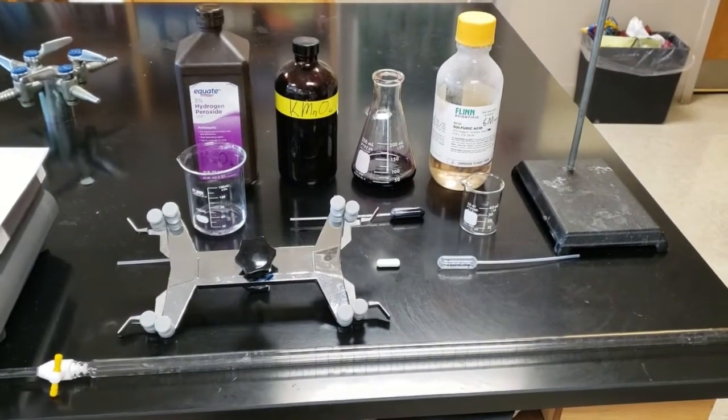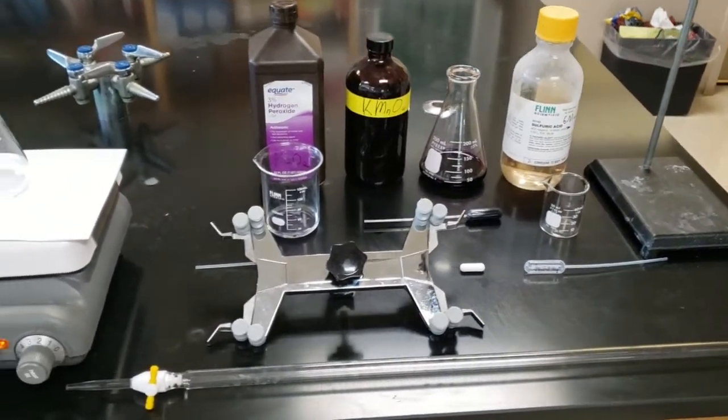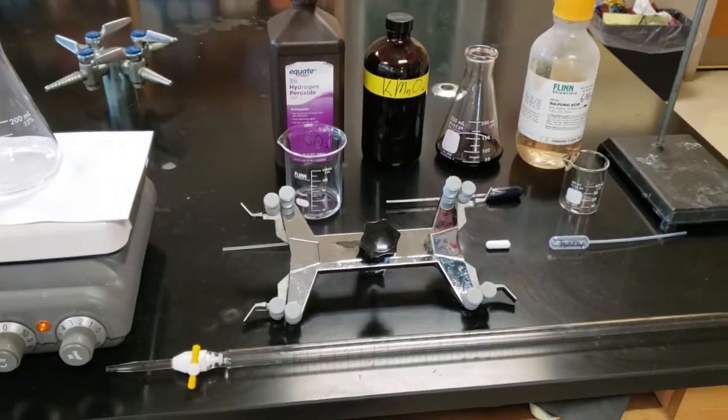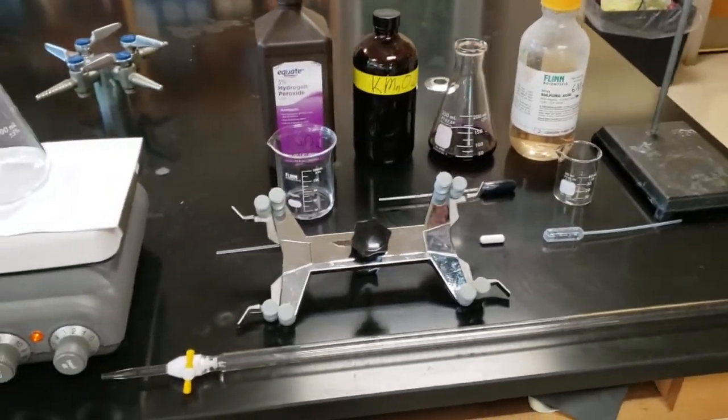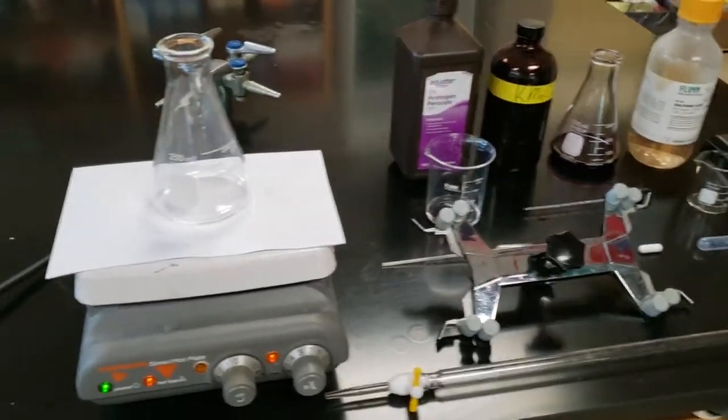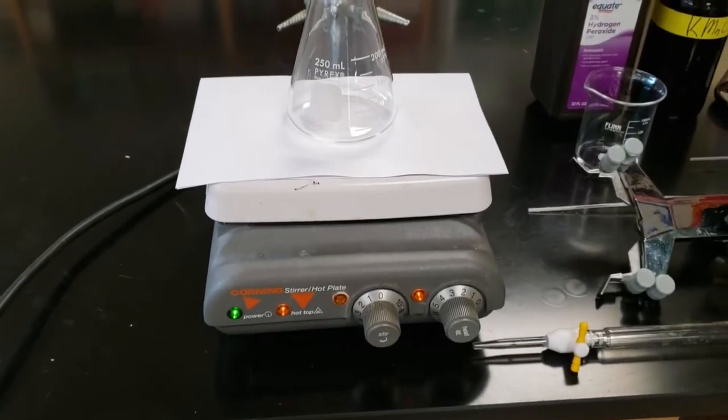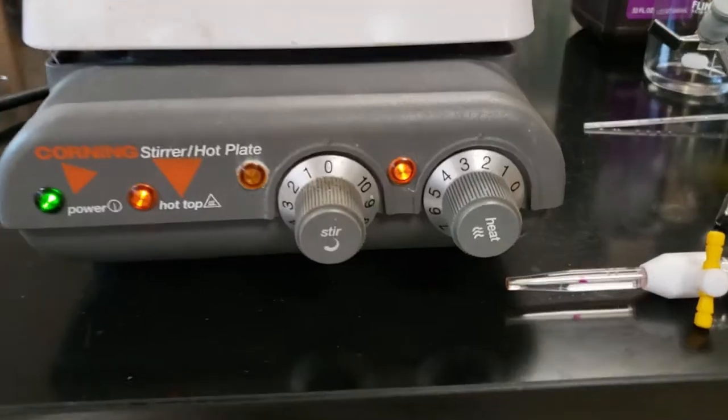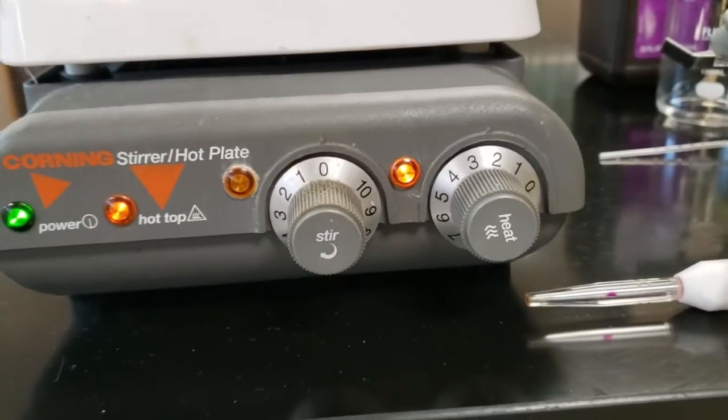We have the two chemicals there plus the sulfuric acid, which is 6 molar. You have a burette clamp, a 50 milliliter burette. Here we have a hot plate with a stir bar. The stir will make it stir and the heat will make it heat, so we're going to only turn it up a little bit to get it warm.